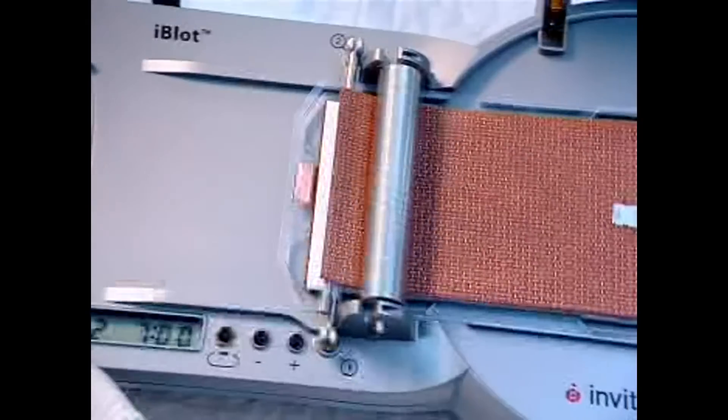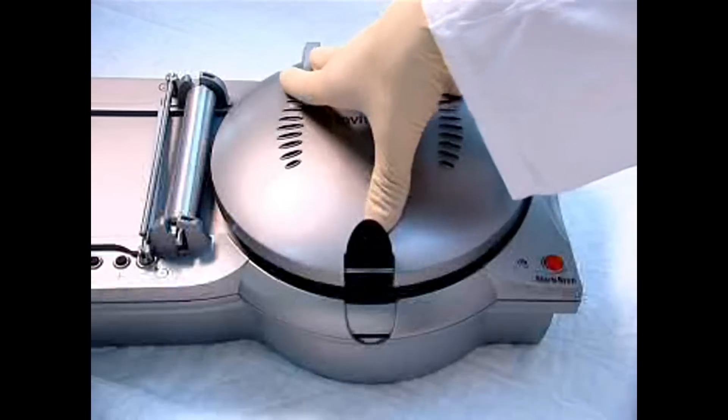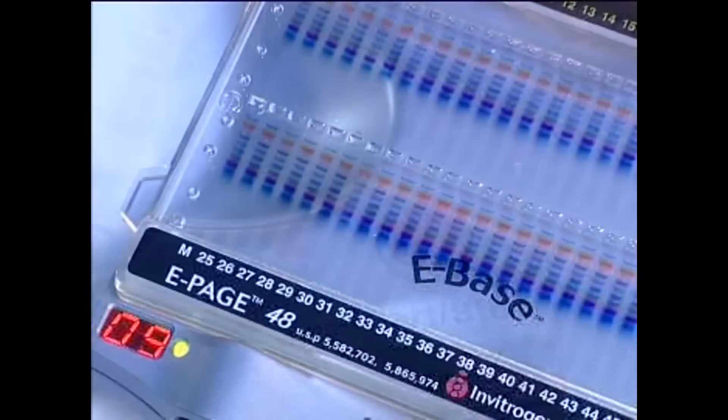Combine ePage and iBlot, and it now takes you just half an hour to separate and transfer no less than 48 protein samples.